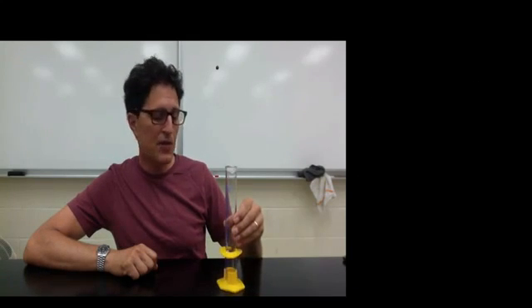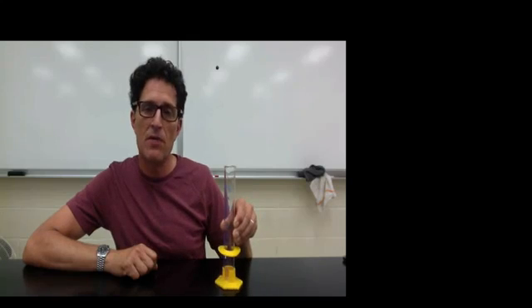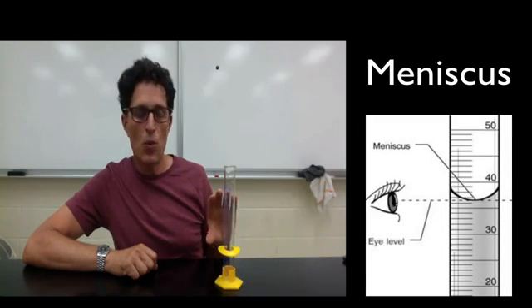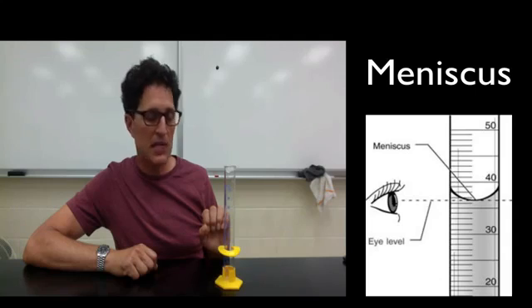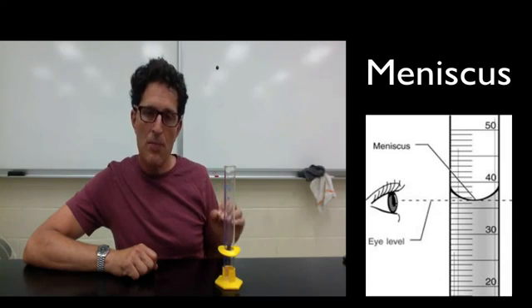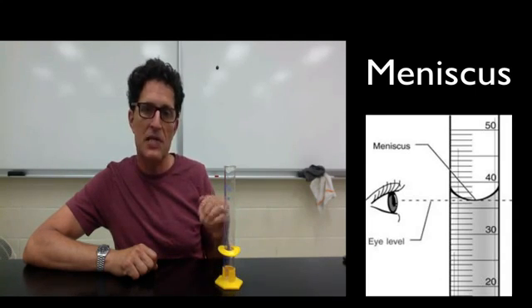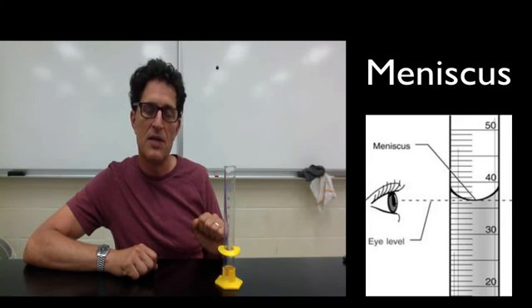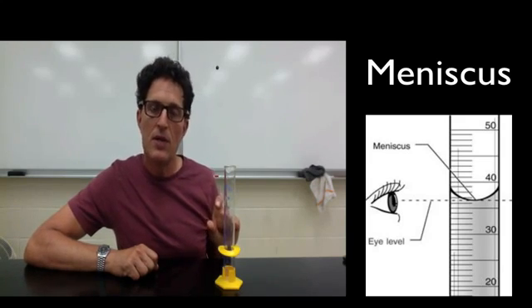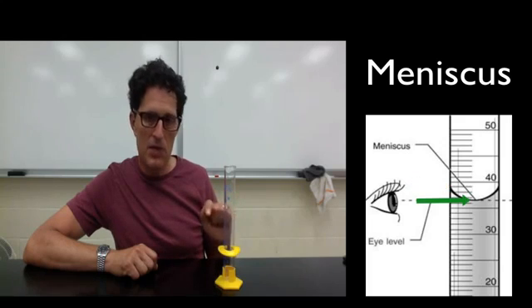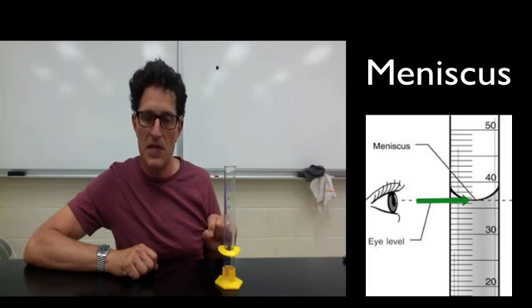The third thing is that you have to read from something called the bottom of the meniscus. Now, when a solution or water is placed into a graduated cylinder, the properties of the water or the solution tend to make it want to climb up the sides of the graduated cylinder. You want to avoid reading the top of the meniscus and read from the bottom of the meniscus where the true volume is.